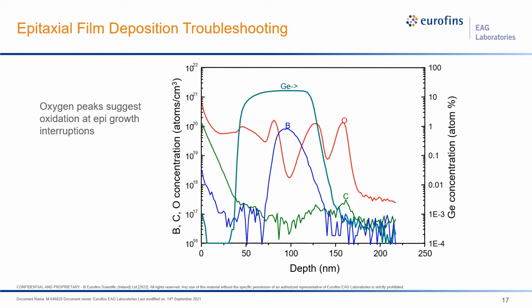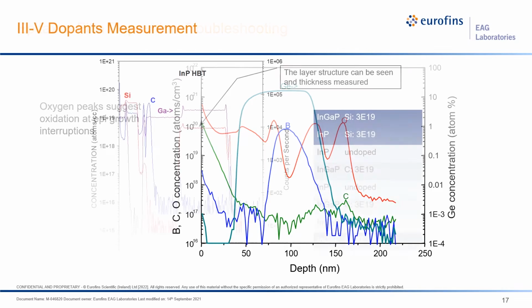Nevertheless, SIMS, by detecting low-level impurities at different locations of a profile, can be used as a very good guide to do a failure analysis or epitaxial growth.